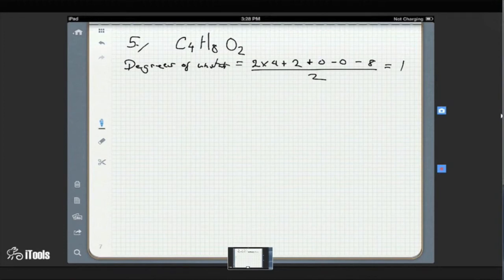So yeah, it looks like we have an alcohol here. Is that a doublet? Yeah, it's a doublet. So it's adjacent to 1.